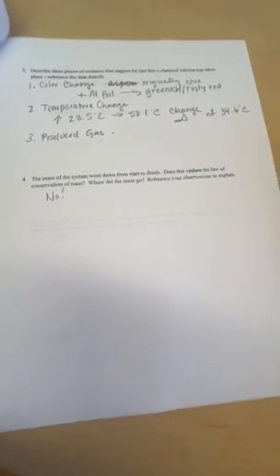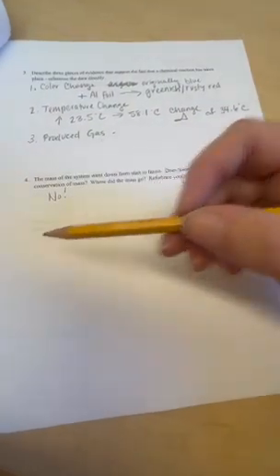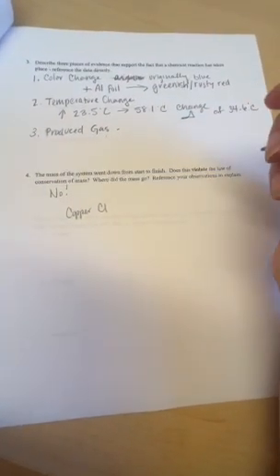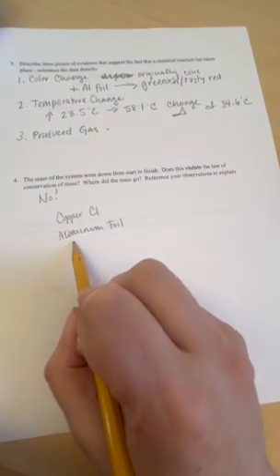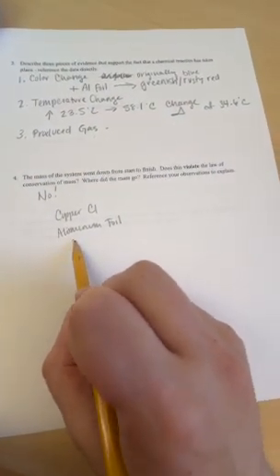We now have a mixture that incorporates the copper chloride solution, and then we also have the aluminum foil, which are all in there, right? But we have a smaller amount of that aluminum foil, or what we can physically see as a smaller amount.